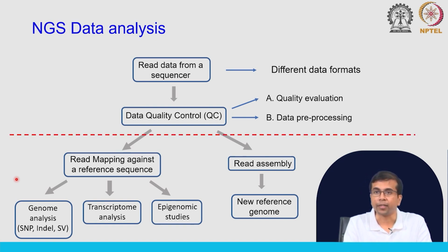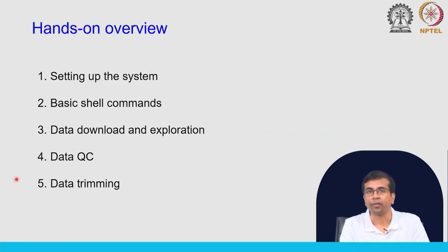Okay, so, we have discussed up to this point and this is something which we will talk about in this class and subsequent classes, right. And as we go along, we will also have hands on for each of these parts including read mapping, read assembly, etc. Okay, so, let us move on, right.